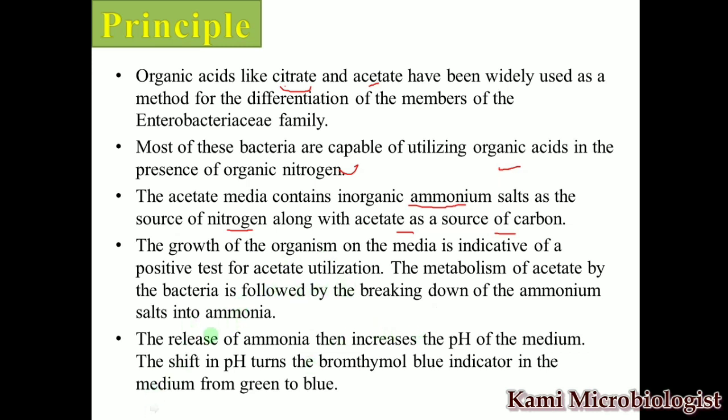Okay, it is converted into ammonia. Now what happened after that? After that, the ammonia will increase the pH of the media. So when the media pH is increased, what happens? We have an indicator which we call bromothymol blue indicator. This will change from green to blue. So that's why the whole media is working, the whole test is working.